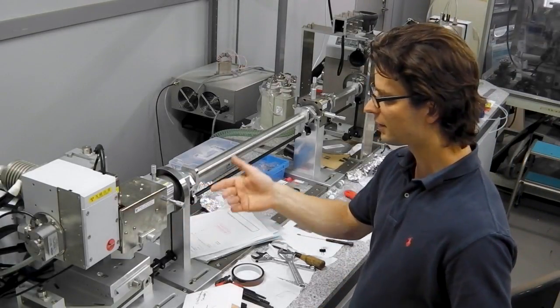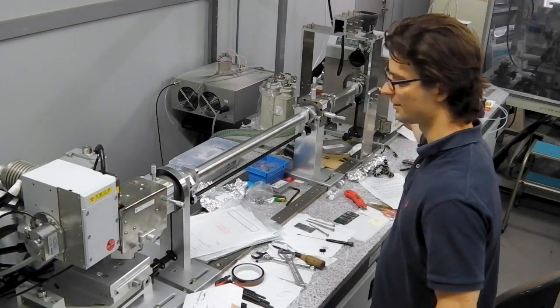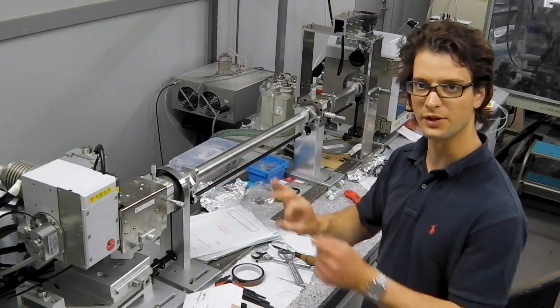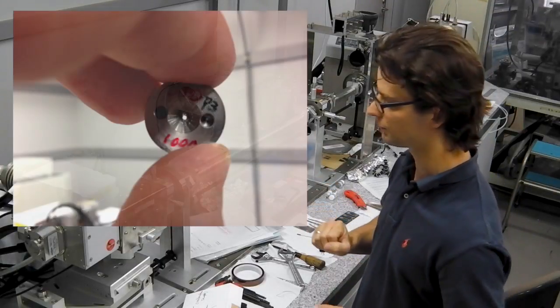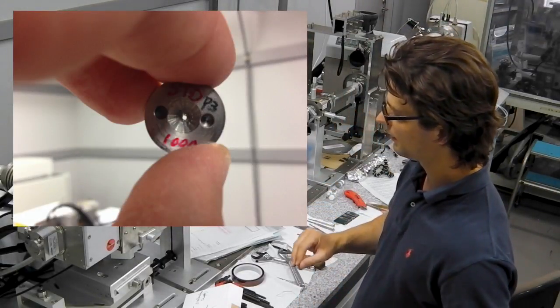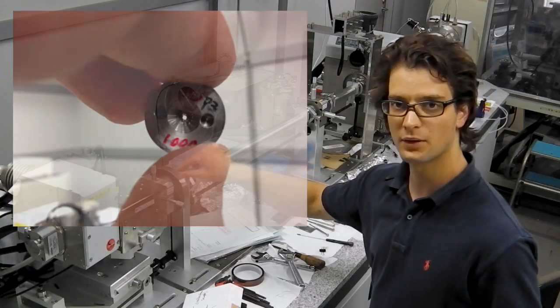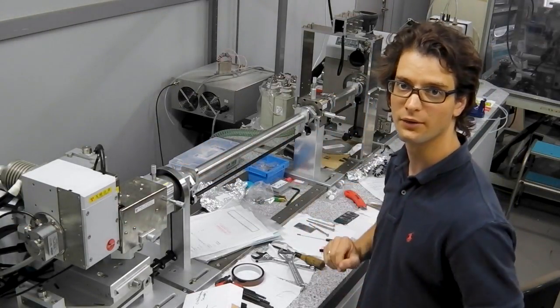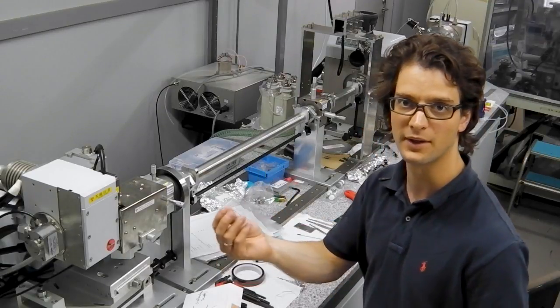After the optics comes the collimation system. This collimation system consists of pinholes, which are small plates with a hole drilled through them. You insert the pinholes manually over here. So if you want to change the size of the X-ray beam, you need to manually change the pinholes.